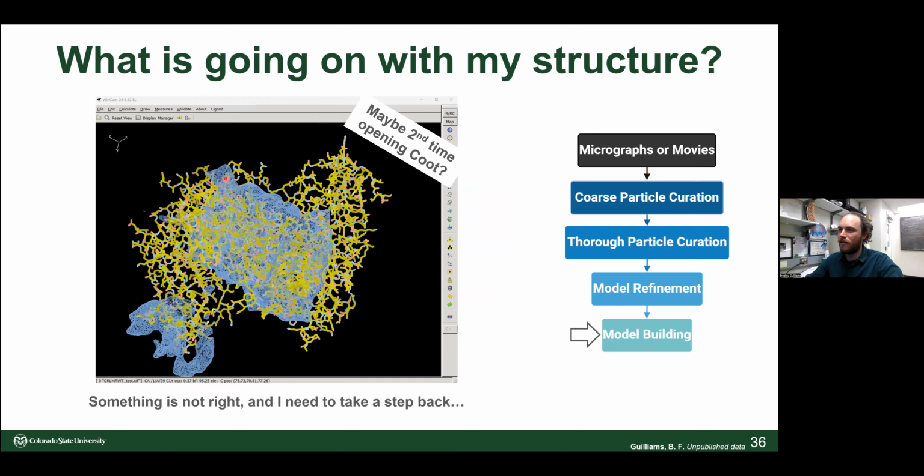So one of the last things I did, I reached out to a friend and collaborator of my boss, Dave Bushnell: is there any way to fix scaling in Coot, right? This map in blue is way smaller than these coordinates from an AlphaFold model. Something's not right. Maybe if I make it bigger, it'll fit. Okay. Something's not right though.